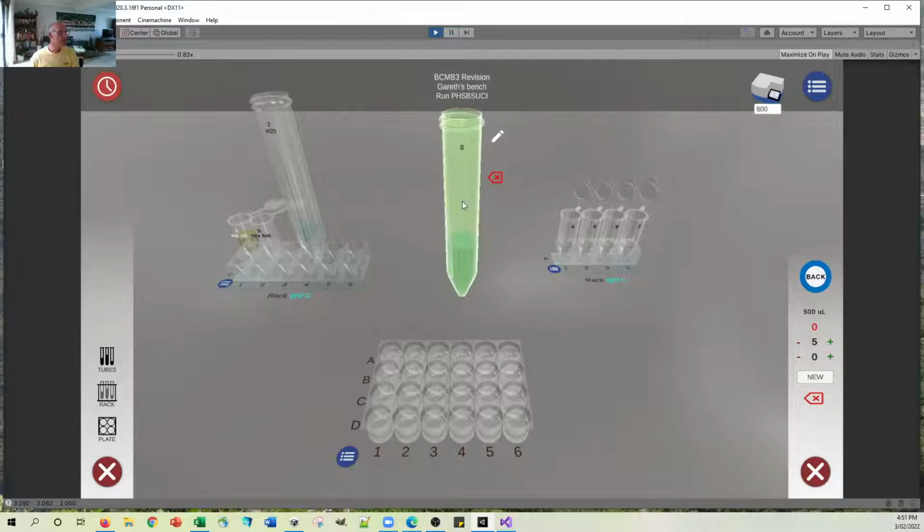And then, of course, the silly thing to mix this, you have to press M, and then you have to sort of suspend disbelief that that hasn't gone all over the lab. That's another thing I need to fix. Probably a little cap to go on there. All right, so this is 50 millimolar. Let's label it. So Tris 50 millimolar. That'll be what we do everything in.